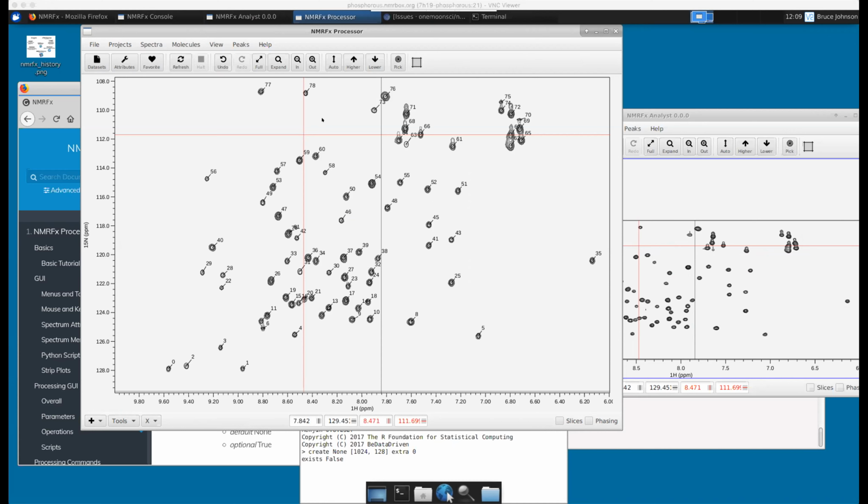Thanks, Bruce. That was wonderful. Incredible. I cannot believe how many features you pack into your software interface and just the intuitive feel that you can give us for working with NMR data sets. This is really impressive. We squeeze it in, so I hope people like what they see and go home and use it. That's the bottom line.